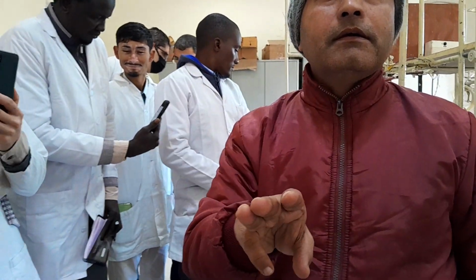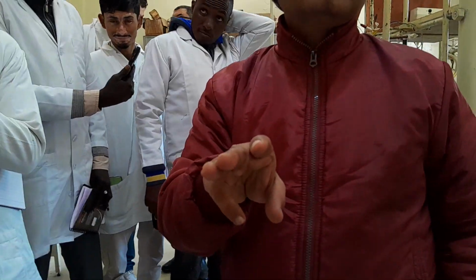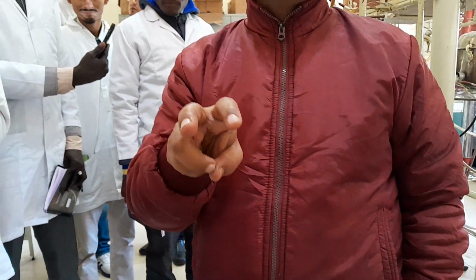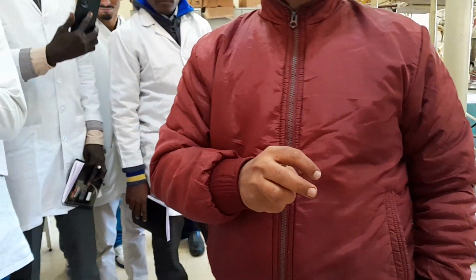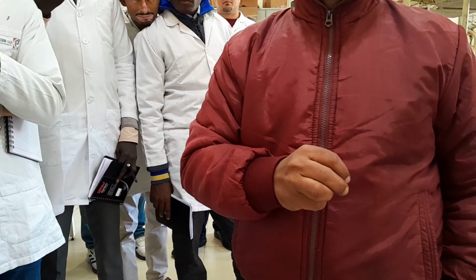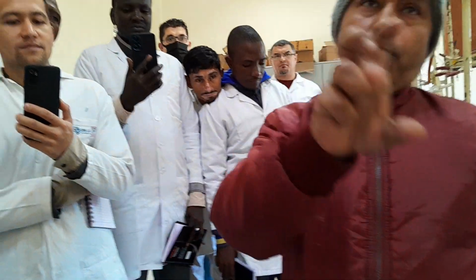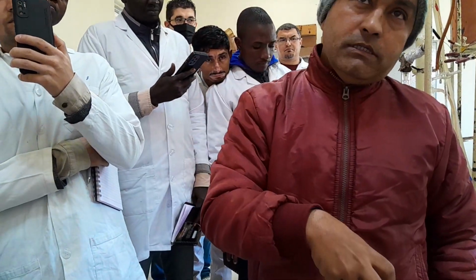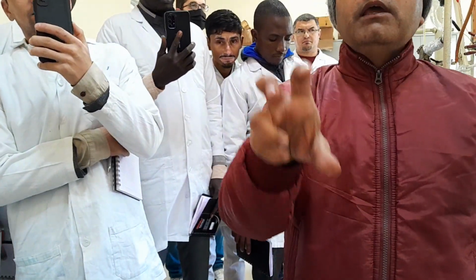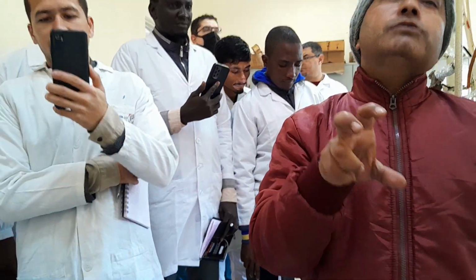I have a question. Our refinery receives many oil fields, different oil fields. Sometimes we take crude oil from the Middle East, and sometimes we have local oil. How can we do this? Do we need to send all the samples here? No, we are only sending the report, but the crude oil first comes to us. Once, if we are not satisfied with the report, we are not going to send it to the refinery.